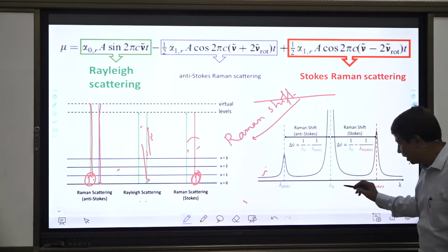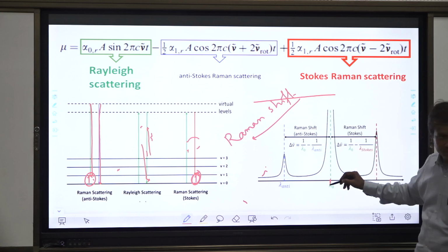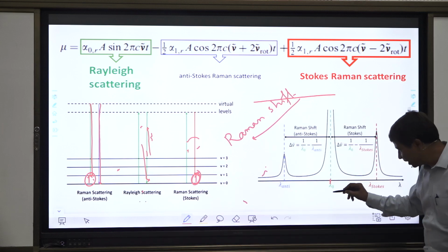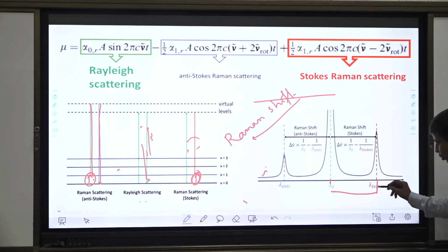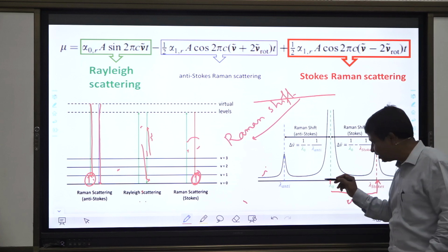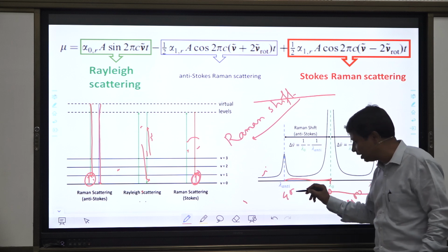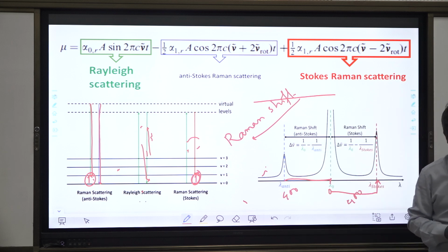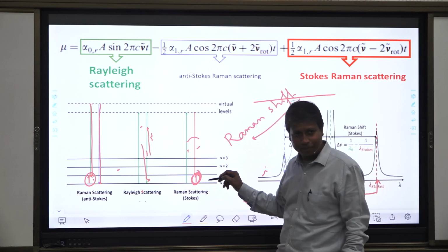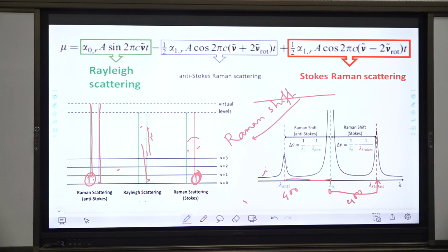That is why in Raman spectrum, you see at the center position is the strong Rayleigh band, that is this one, and from the center, wherever the Stokes shift comes, if it is 400, then in that direction it is 0. In that direction, exactly at 400, your anti-Stokes bands will come, because both indicate the same difference of the energy level. And these bands are coming because of the difference of energies.